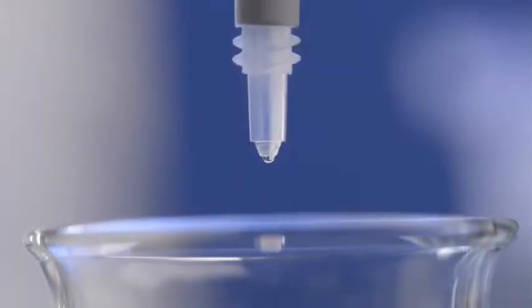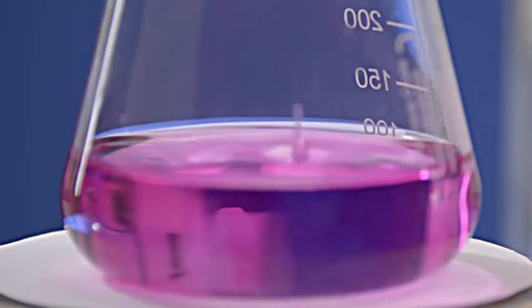Determining the end point, drop by drop, if necessary, even to three decimal places. No problem for the titrate!